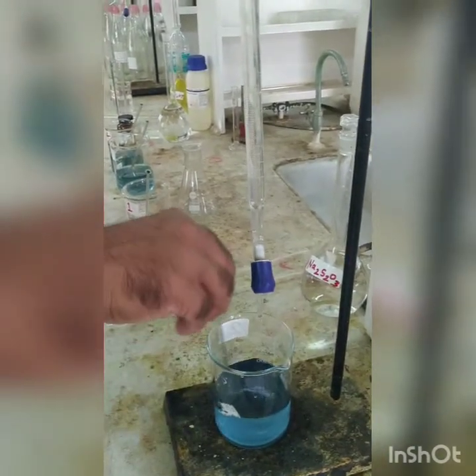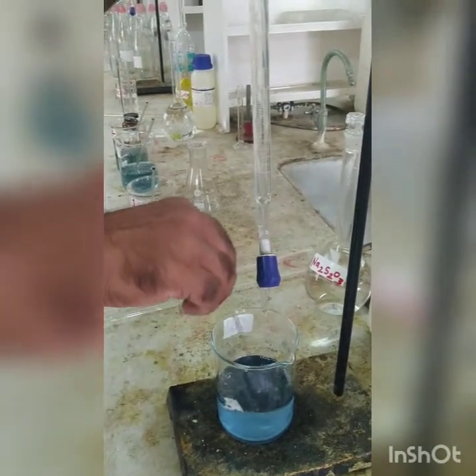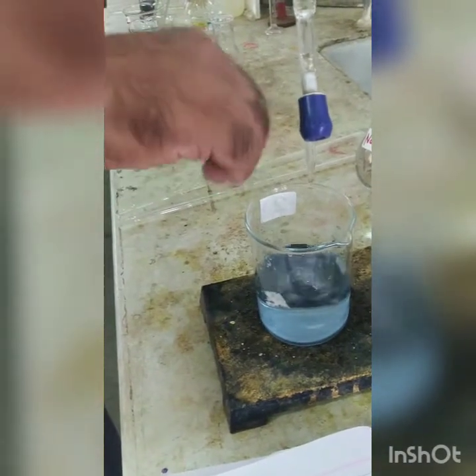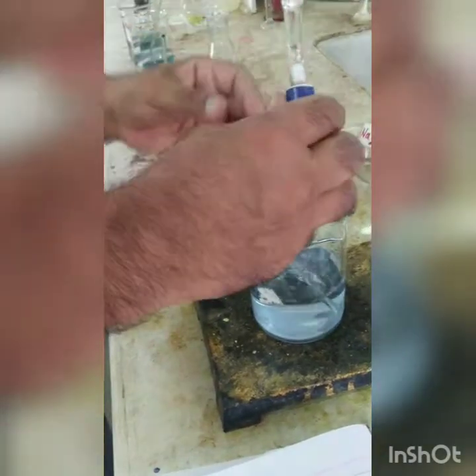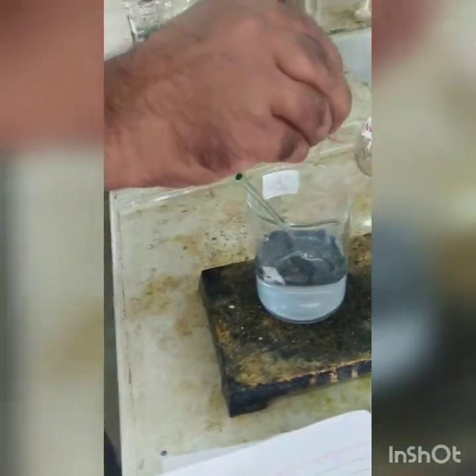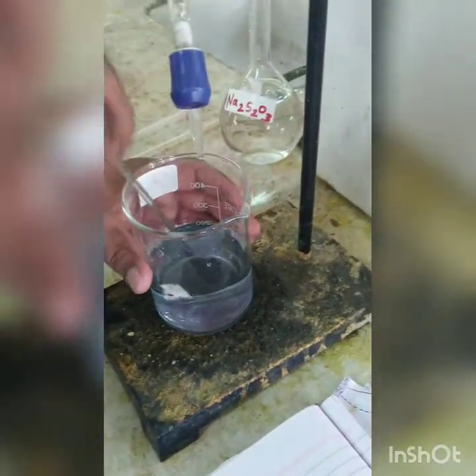Again, stir it. Stir it. Still some bluish tinge is seen. Against the light, if you see a little, just check it against light.